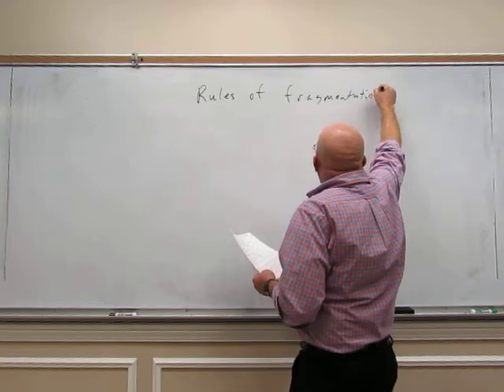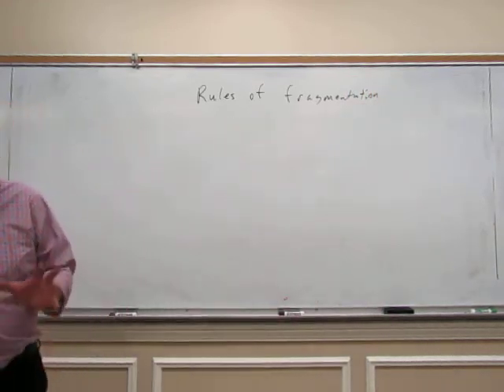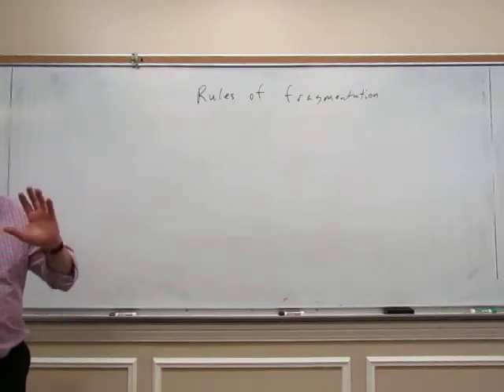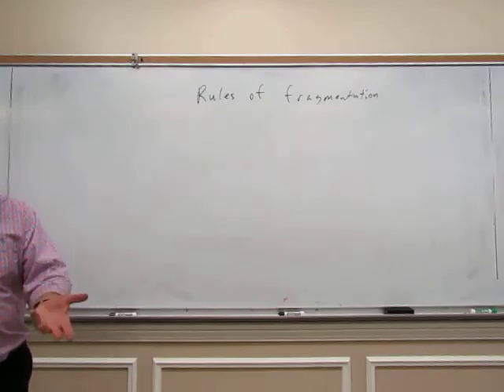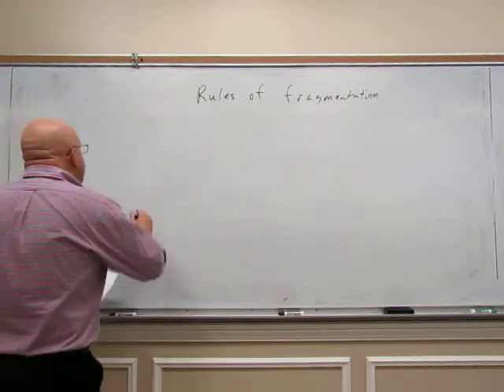So the way the molecule wants to break apart is that we're always going to try to go to a more stable carbocation. That's what you need to remember. Remember that. All these rules are going to be based on that. We're always trying to get to a more stable carbocation.